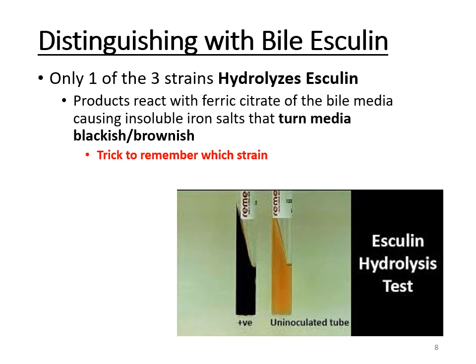And if you've ever played with those games where you take the magnet and you're moving the little pieces around the board, you've seen that dark blackish brown color of iron salts. And so whenever you see the Bile Esculin test turn that dark color, you know E.